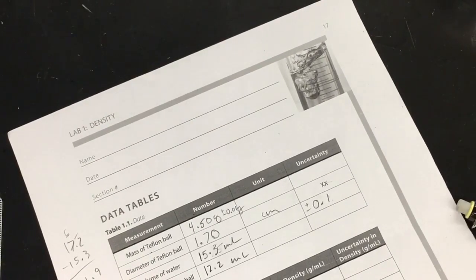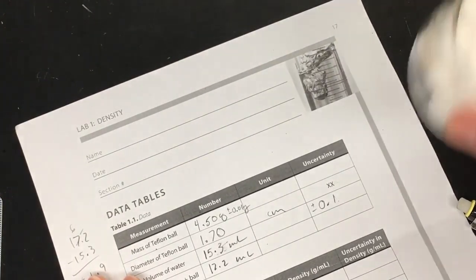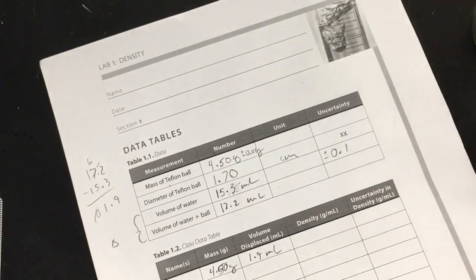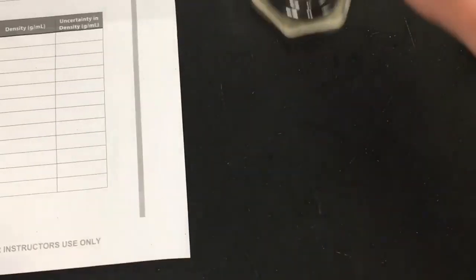Okay. And if I didn't know what these balls were made of and I wanted to find out, I could do this procedure and be like, oh, wow, the density I obtained just so happens to be really close to Teflon. So I think this is Teflon. And real quick, I guess I'll show you my final measurement so you can see.